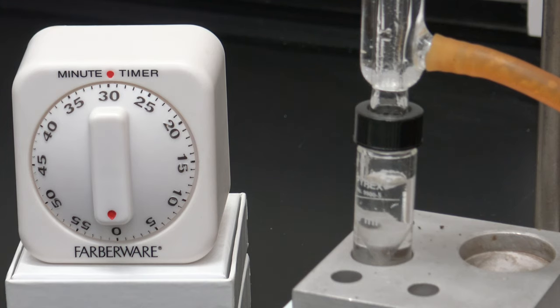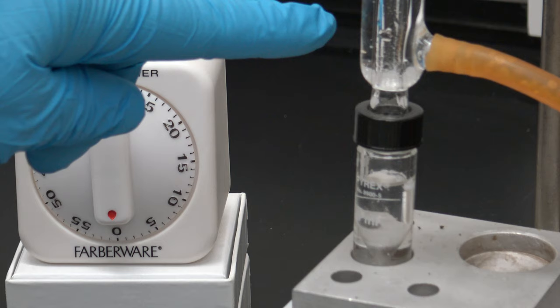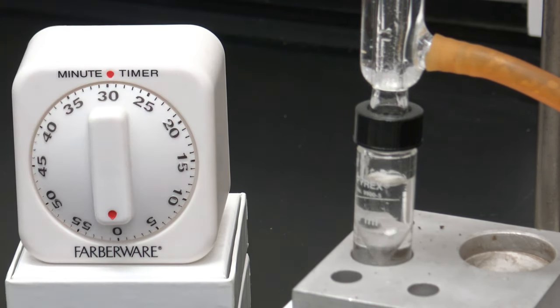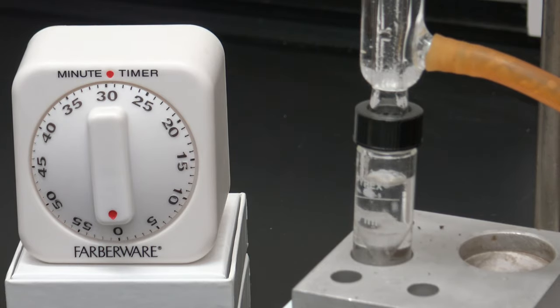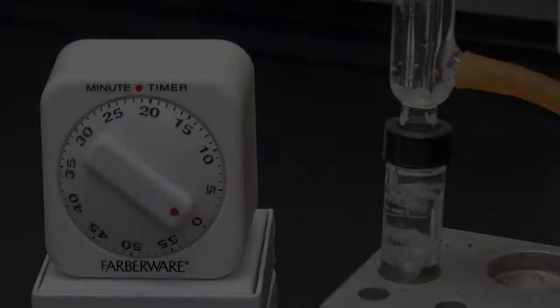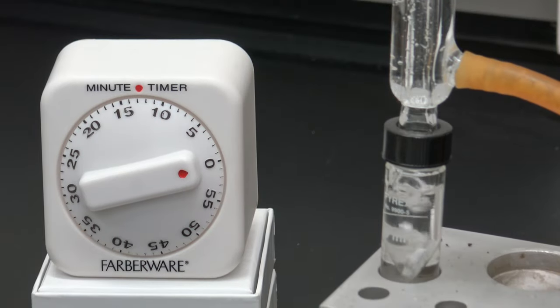You can see in this picture that we have water vapors. Maybe it's a little hard to see. There are water vapors going up to right about here and then recondensing back down into the reaction vessel. You can see the boiling chips bouncing around as it is refluxing. And we're still refluxing.